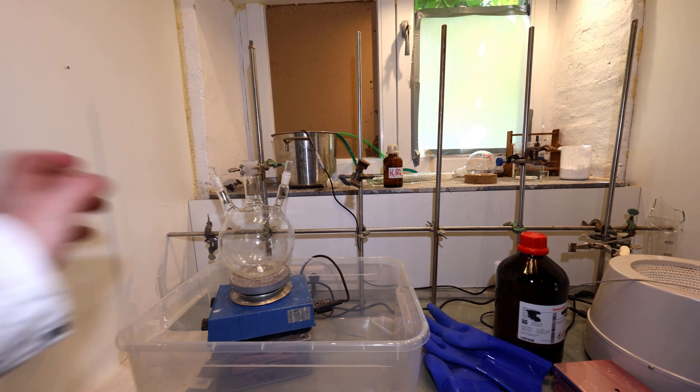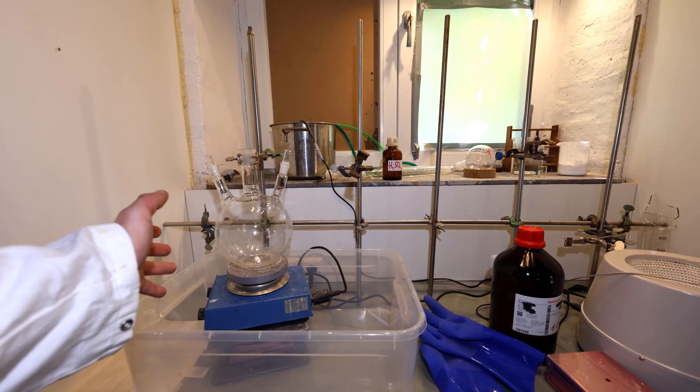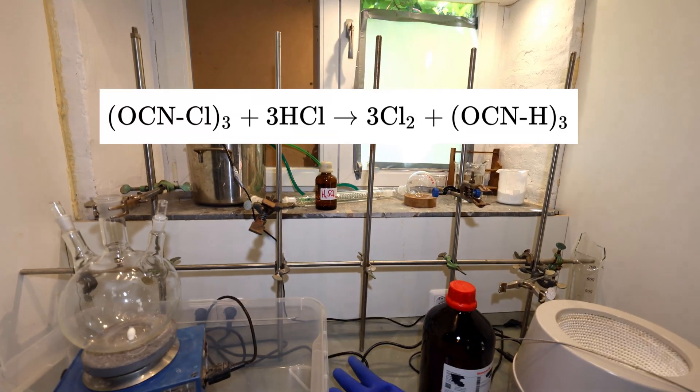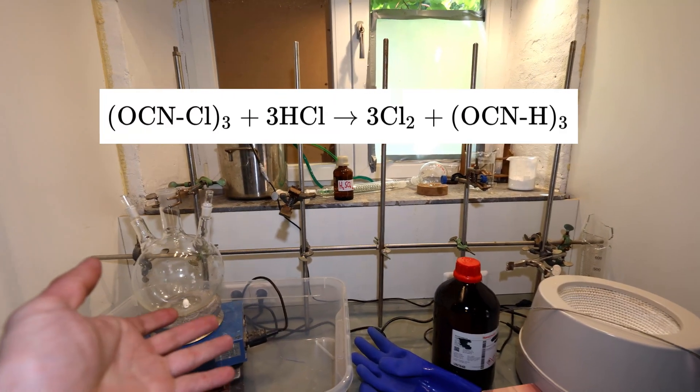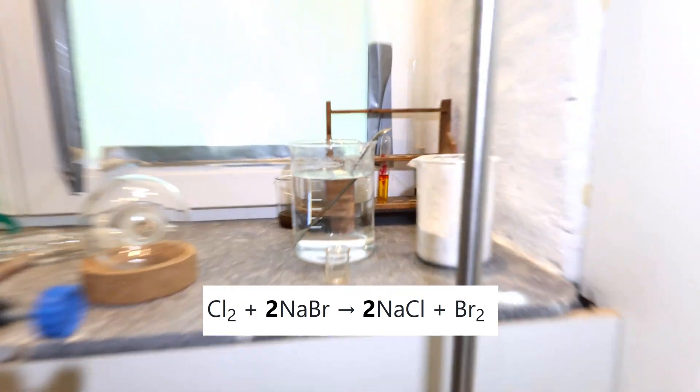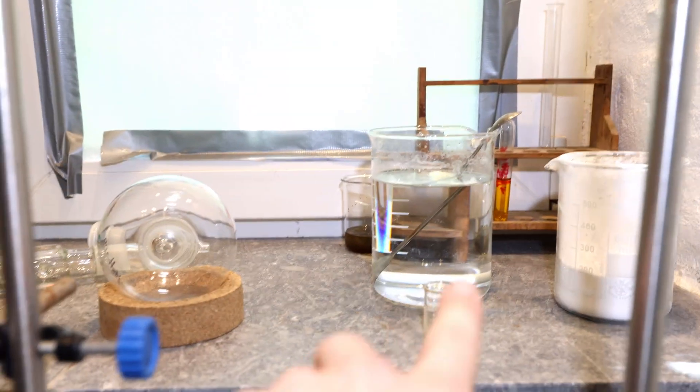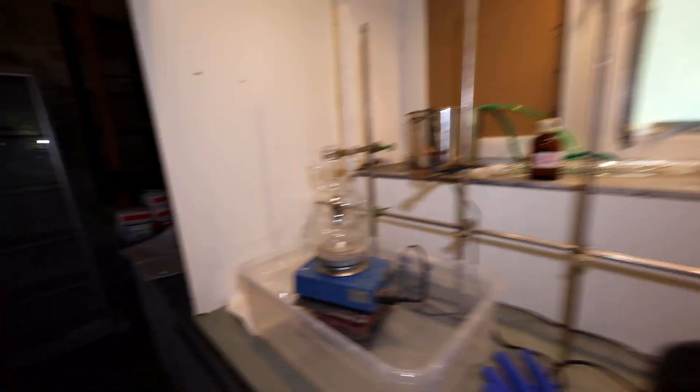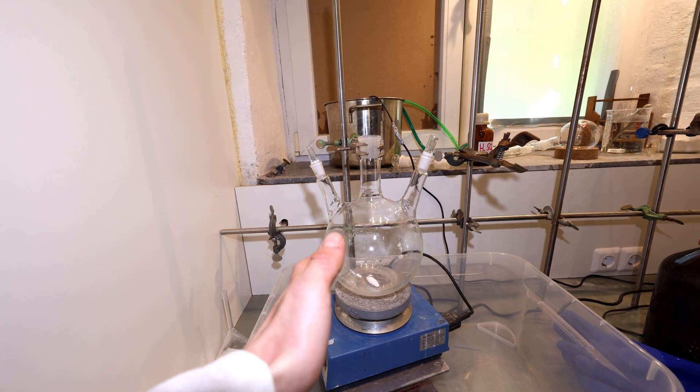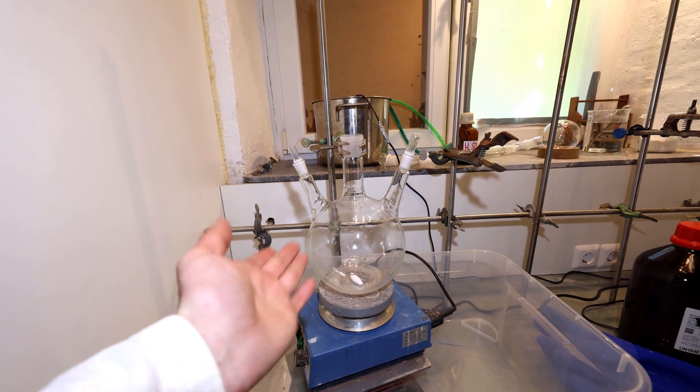What we're going to do is set up a distillation and we're going to react TCCA, so pool chlorine like this stuff right here, with hydrochloric acid. This will free up some chlorine and this will react with sodium bromide. We have the sodium bromide solution already in solution and we're going to put all of this inside here and heat this up and this will make a lot of bromine.